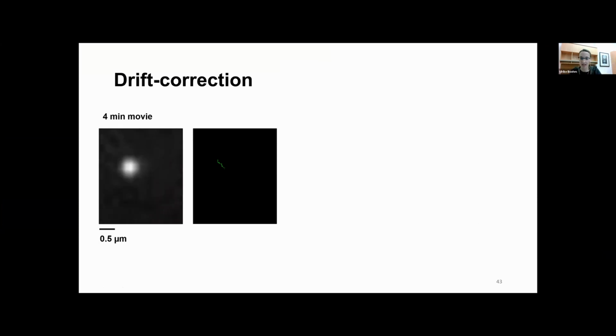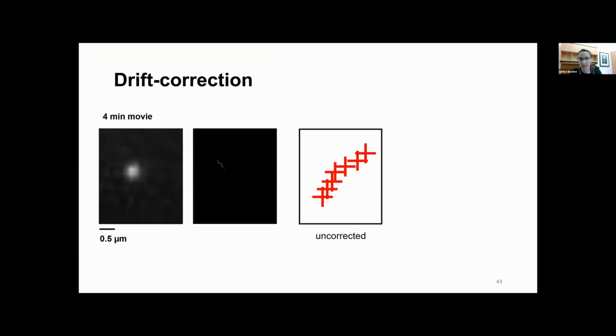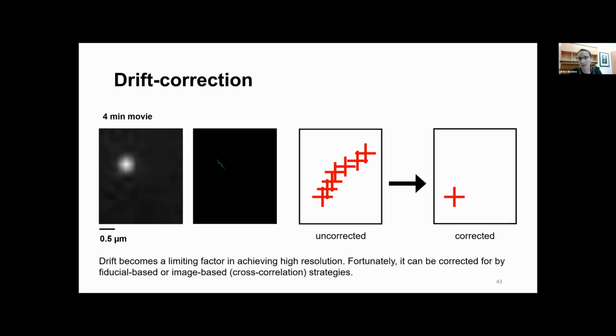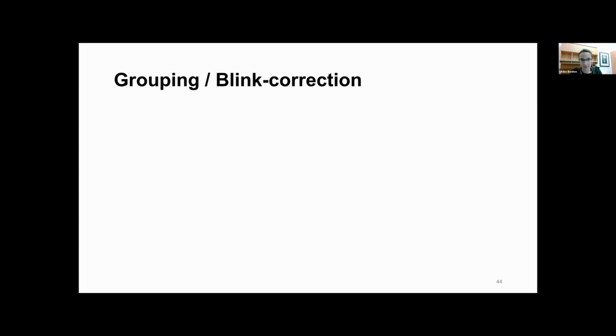What you can actually do is, with so-called fiducials, but also with other strategies, this drift can be traced. And once this is traced, you can also trace it back. So there are ways to actually correct for these types of drifts. And this is something which you need to do in particular, because you take so many images over time. As I said, there are different ways to do that, but I don't want to go into detail right now.